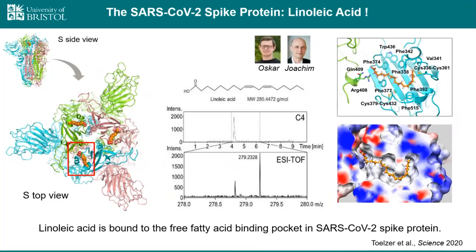So again, a fatty acid with an unsaturated bond, but it is C16, and it really nicely fits this density. And that's an interesting choice for OC43 versus SARS-2, because sapienic acid, I had to look this up in Wikipedia, is one of these fatty acids which only humans make, and it's very abundant.